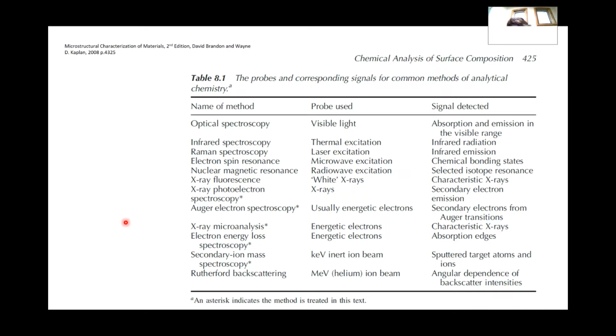I like the fact that they use quote-unquote white X-rays. That just means, what does that mean, actually? I think it means polychromatic. That's very interesting. Oh, it's X-ray fluorescence, of course. Haha, here I am talking to myself, literally. But anyway, I have to remember I'm actually recording a lecture sometimes.